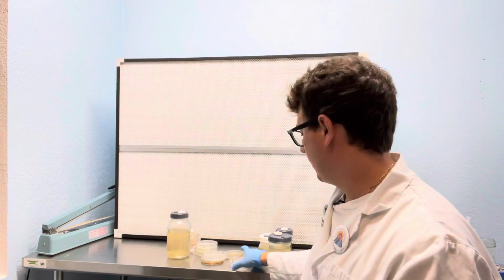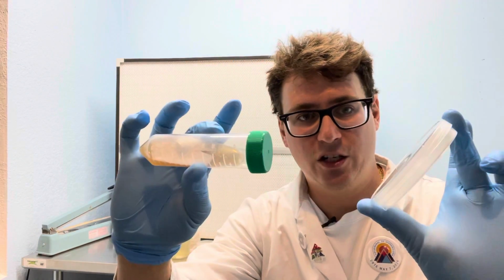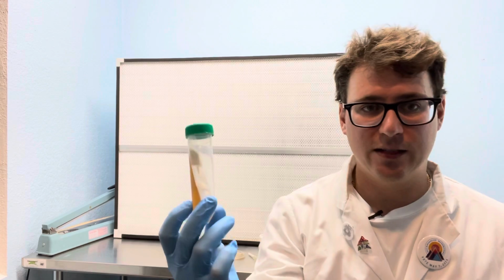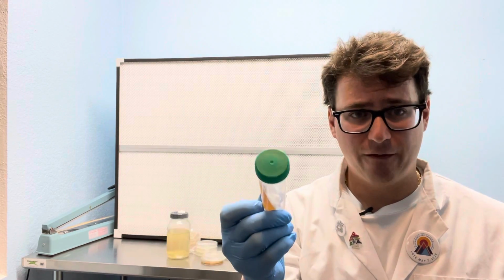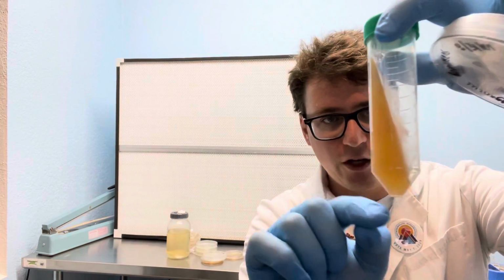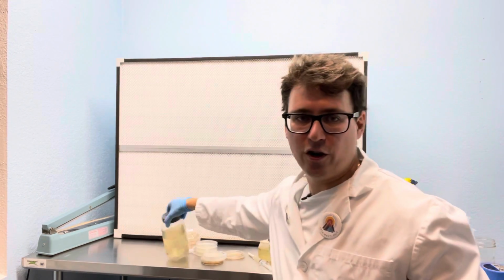But also, when you use a slant culture compared to a petri dish culture, the opening is significantly less on this one as well. So slants are a little bit safer, which is why I use them for long-term storage. You can check out our video on why slants are important, and that brings up our last and final difference between the two: with a slant culture, you can refrigerate these, and this reservoir of nutrients here will outlast any liquid culture, even refrigerated.